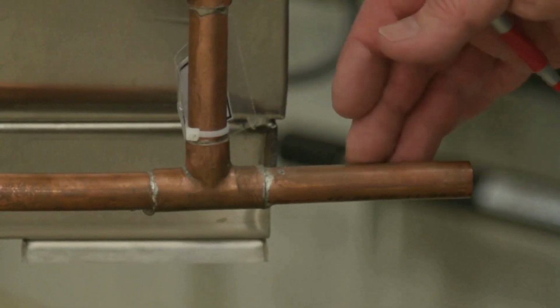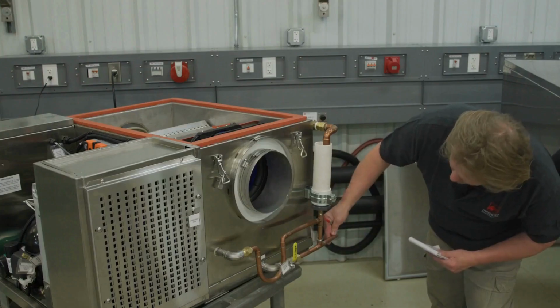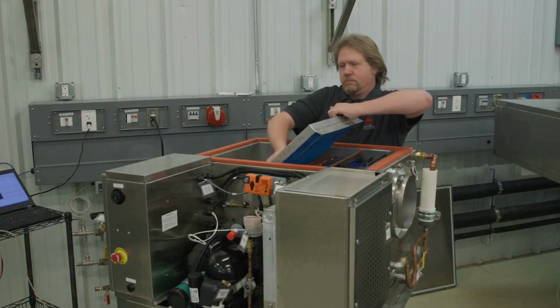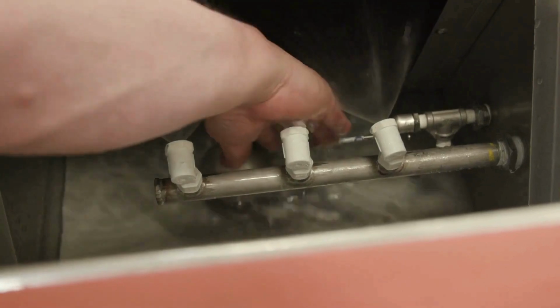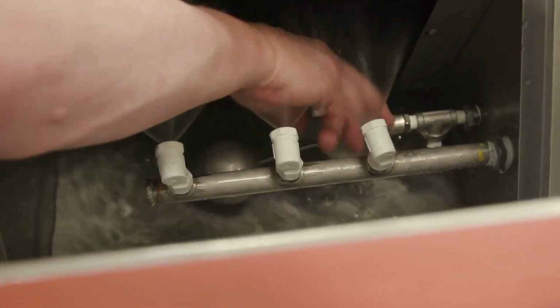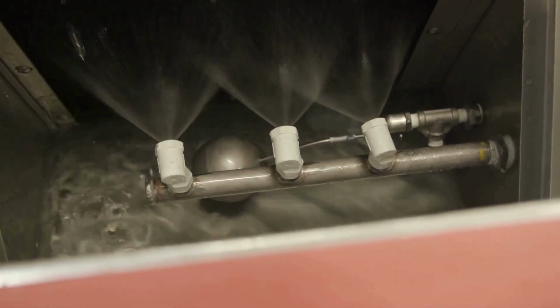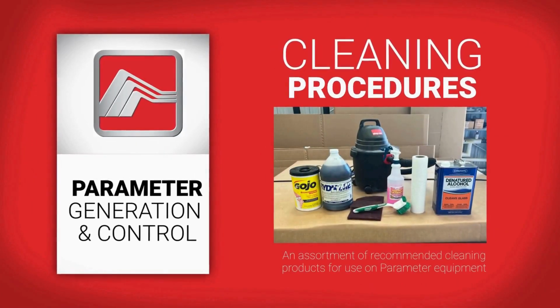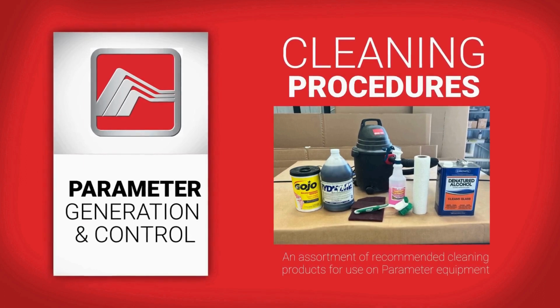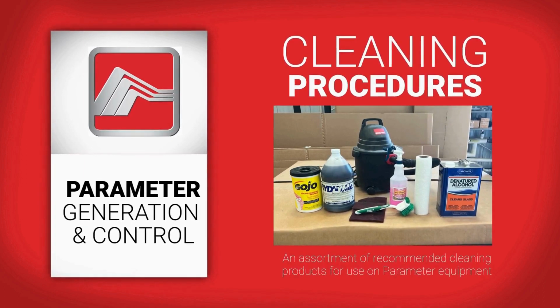Next, confirm condensate valve functionality and verify that the sump level is properly controlled by the water level control float valve. Next, we'll begin the cleaning process. The machine we are working on is brand new and therefore not dirty, but we will show you the proper areas and techniques for reference.